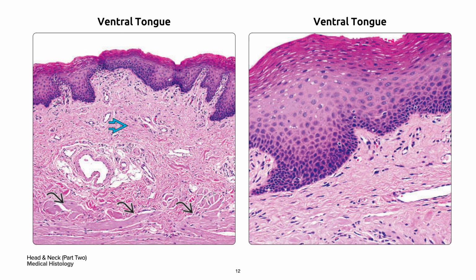On your left is the ventral tongue, which lacks papillae, giving it a smooth, glistening appearance macroscopically. Note the small amount of loose connective tissue, in the bold blue arrow, which separates the mucosa from the tongue muscle, in the curved black arrow.